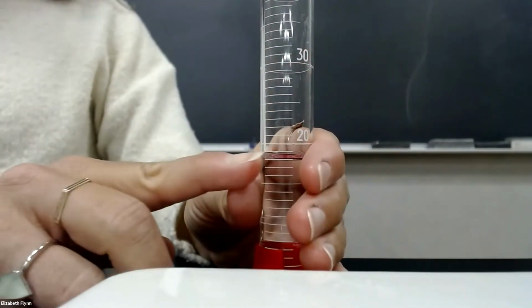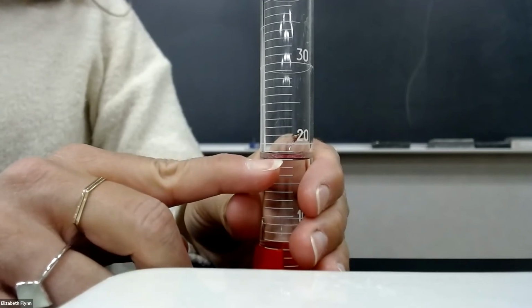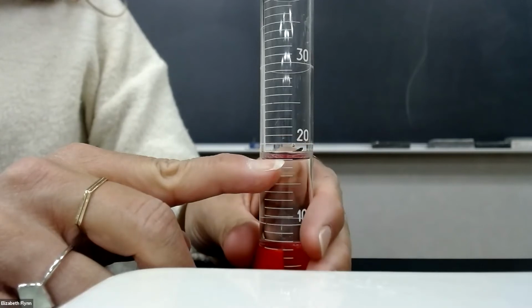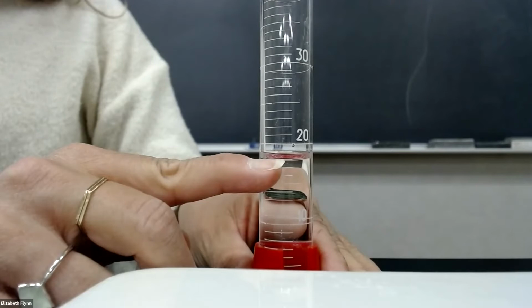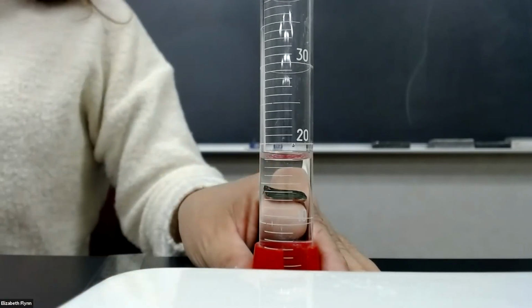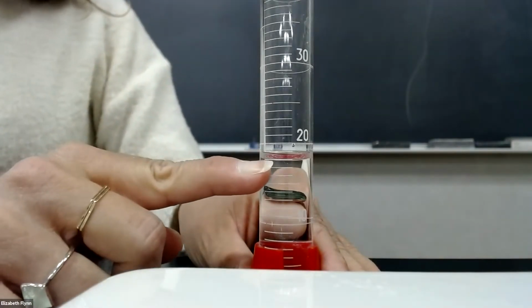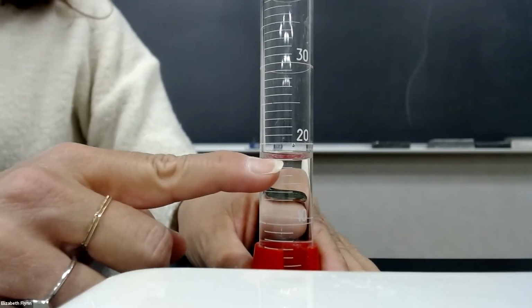All right. So as we'll see later, if it were exactly on this line right here, if this meniscus bottom was exactly on that line, what would we say? It's a little below. If it were exactly on the line, we would say 18, not just 18, but 18.0. So that 0.0 tells us that the instrument is precise to the 10th of a milliliter.